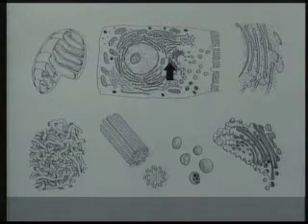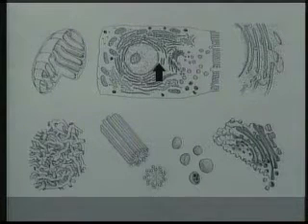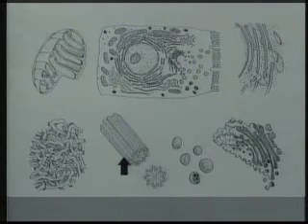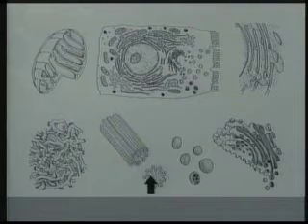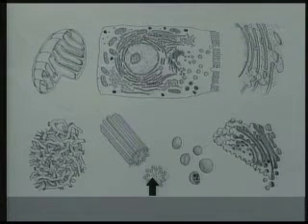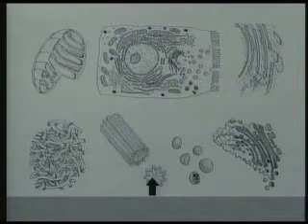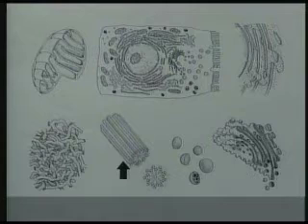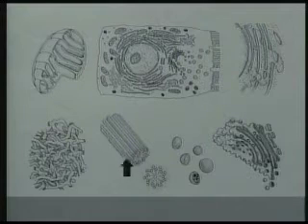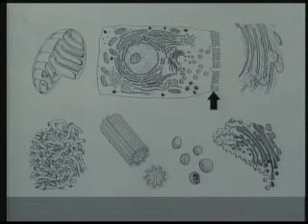Also in the cell you will find, like right here, centrioles, usually near the nucleus. And a centriole is shown at higher magnification here. It consists of 9 triplets of microtubules associated in sort of a cartwheel form, shown in cross-section here. And in animal cells, such as human cells, centrioles are seen at the poles of the mitotic spindle. And often centrioles are found at the bases of cilia, in which case they're called basal bodies. And up here, the apical cell membrane is thrown into a lot of folds called microvilli.